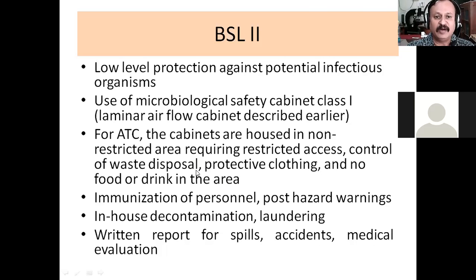But in biosafety level 2, there are certain things which are important. Especially if it is an animal tissue culture laboratory, or if it is microbiology kind of work, then these cabinets must be housed in a non-restricted area, but one which requires restricted access.